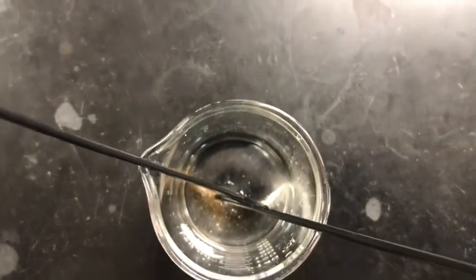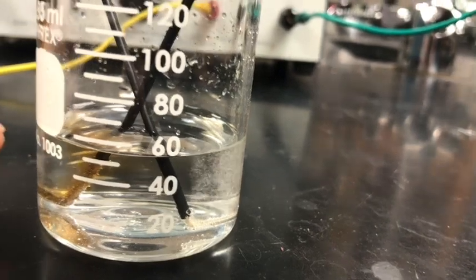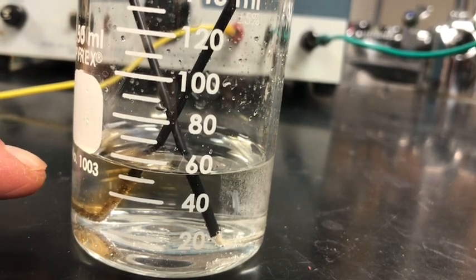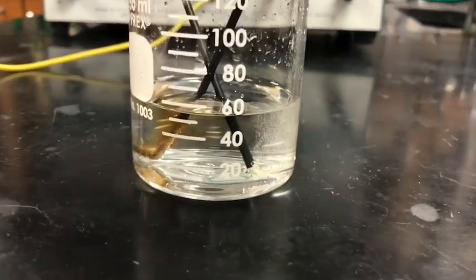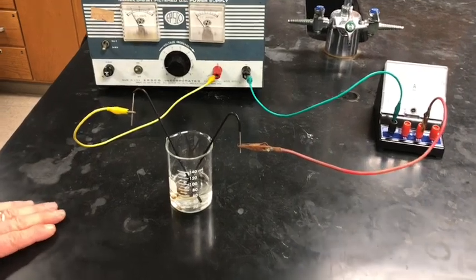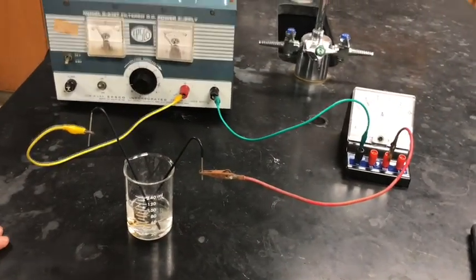Some bubbling is happening. Notice we're getting a brownish color showing up over here — that's at our negative post. And there are a lot of bubbles coming out at the positive post. We're going to go ahead and turn the camera off now until our five minutes is up, then we'll be back to turn this off. We're currently at one minute twenty-seven seconds, so we'll let this go for another few minutes.